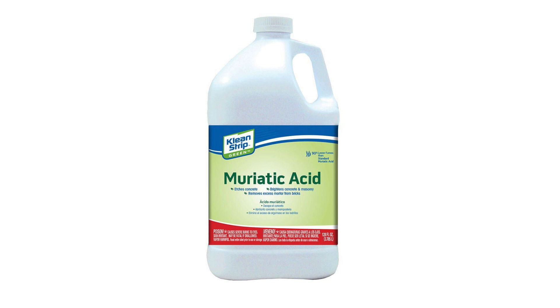Hey everyone, today I'm going to show you the procedure I made to turn 34.5% hydrochloric acid, aka muriatic acid, into concentrated hydrochloric acid.